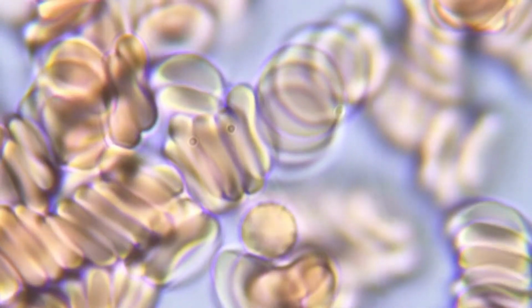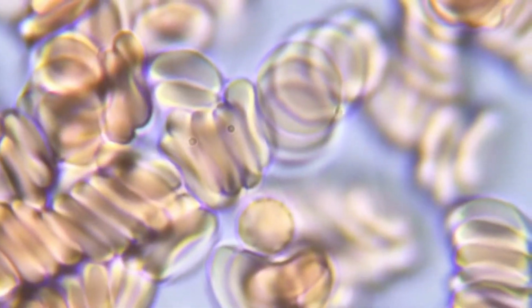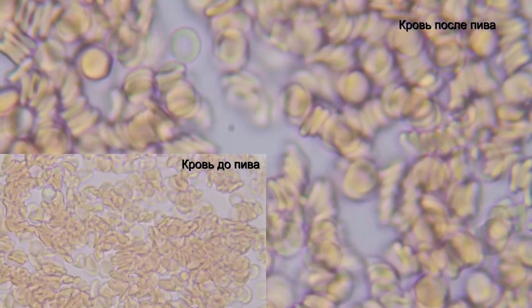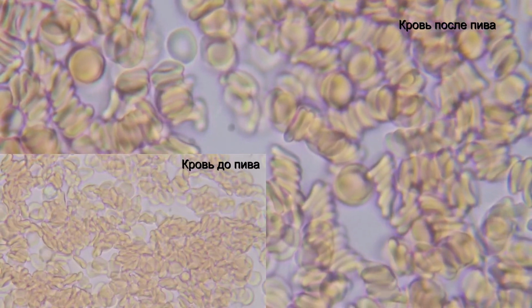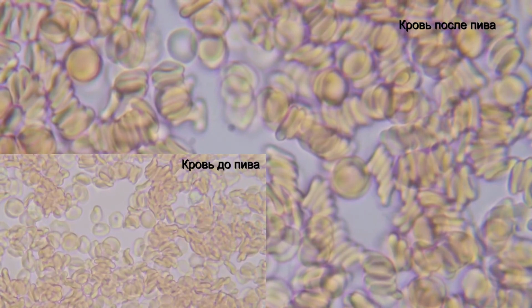You can also observe these distinct rouleau formations right here. You can clearly see them in this area. There are several long rows and multiple thick layers. Well, right here we have a very interesting result to look at. You can clearly see the significant changes that happened in the blood after drinking the beer. Think for yourselves.